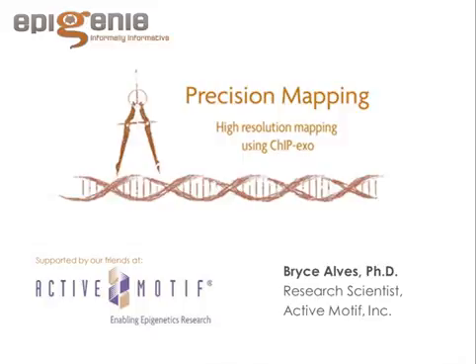Okay. This next question is referring to the data analysis steps. Without removing duplicates, is there a recommended QC for library complexity or over amplification? Or is that an issue at all? That's a good question.